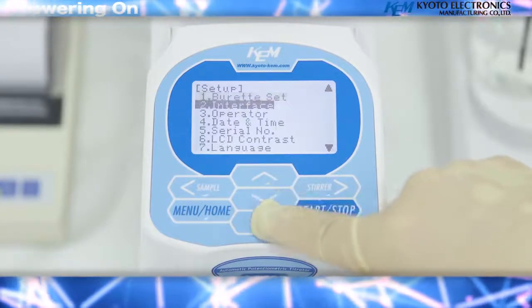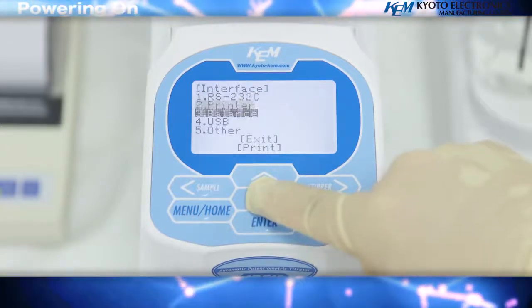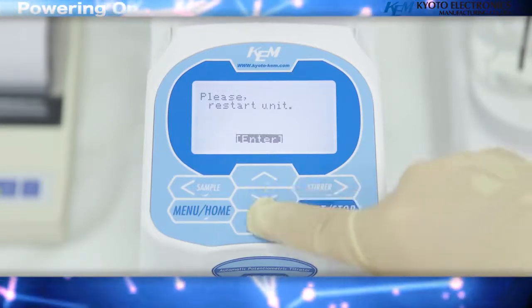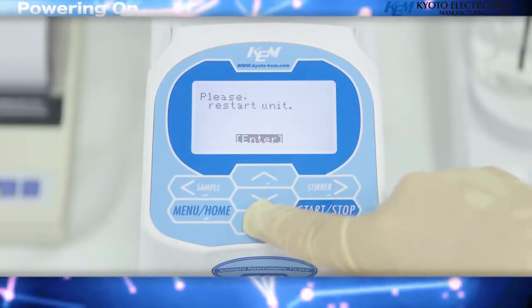Next, select the second option, Interface, and press Enter. Select the fourth option, USB, and press Enter. Then set the mode option to MCU and press Enter. Turn off the power.